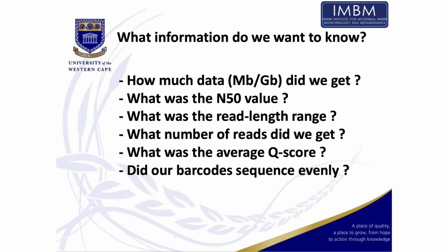Hopefully that's not what we get. We get some gigabases. What was the N50 value? And I'll explain what the N50 value is a little bit later. What was the average read length? So the longer the read, it makes it a lot easier computationally to put the thing back together. So a bacterial genome is essentially a circular piece of DNA. So just imagine a circular string.